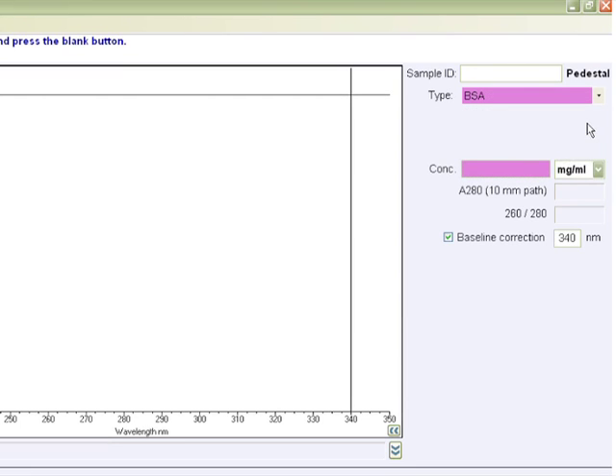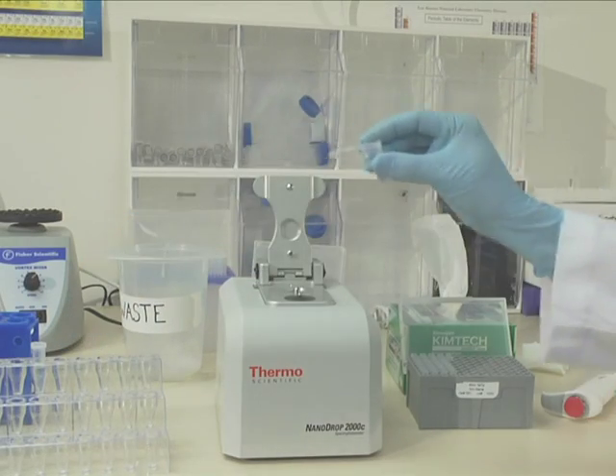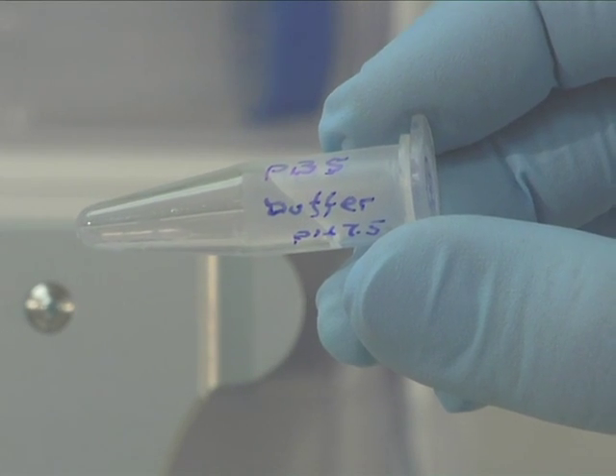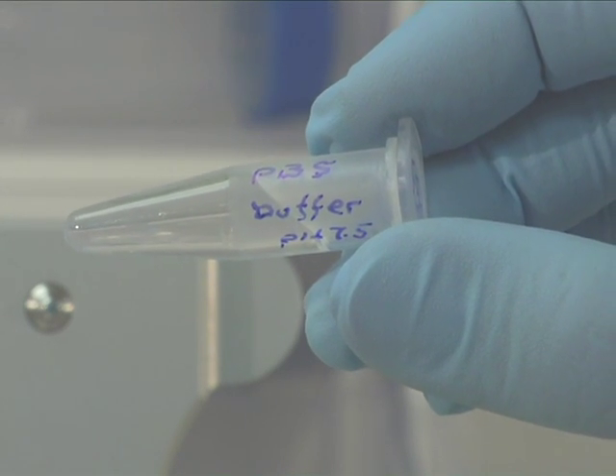Choose the concentration units from the drop-down list adjacent to the color-coded box. Next, establish a blank using an appropriate buffer. It is important to use the buffer in which the protein is suspended. The buffer used should be of the same pH and a similar ionic strength as the sample solution.